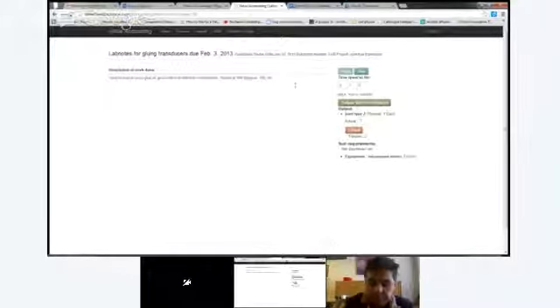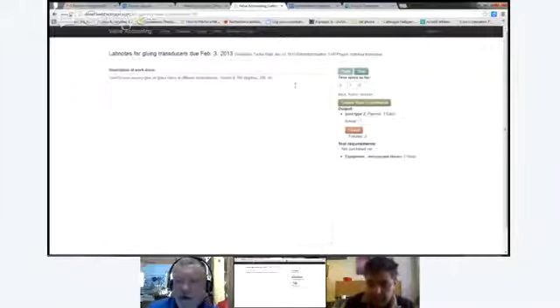That's a good question. I think that's what happened with that one, where there's a bug in the process that it might not have had an output, and I'm going to chase that down because it should not need an output. But at the same time, you've got to consider that there's a reason that I called that one resource type a documented idea, because in that case the resource will be the document describing the idea.